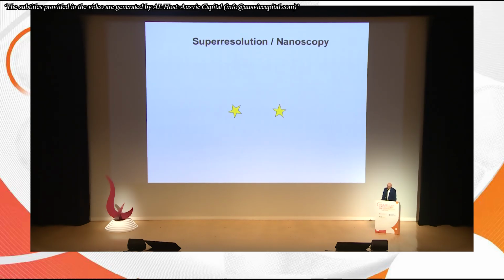So since I worked on resolution, of course, the question is, can you measure the distances directly? Say, if it's below 10 nanometers, can you just take a picture and say, this molecule is here, the other one's there, I subtract the two positions that I found, and then I know what the distance is. And of course, MINFLUX should allow you to do just that.